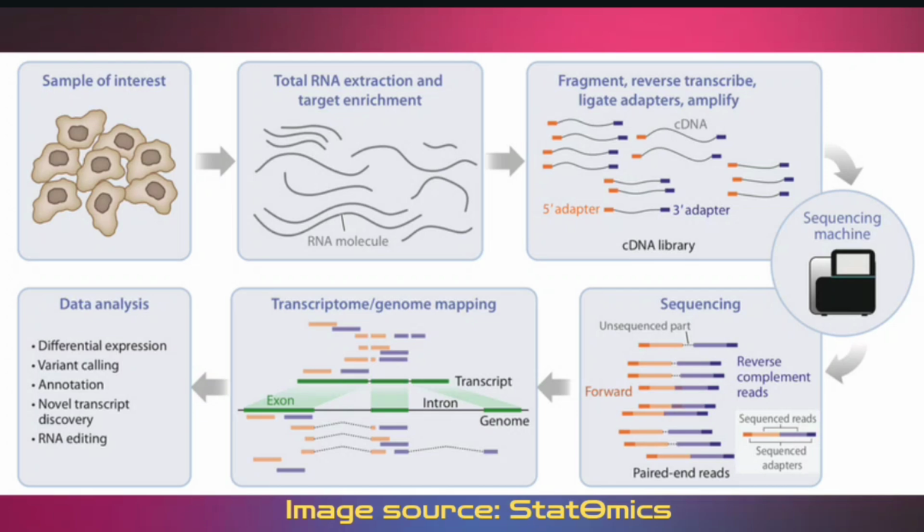Then that cDNA will go to the sequencing machine where sequencing will be done, and then the genome mapping will be done, and finally the data processing will be done where differential expression, variant calling, annotation, novel transcript discovery, RNA editing, these things are analyzed.